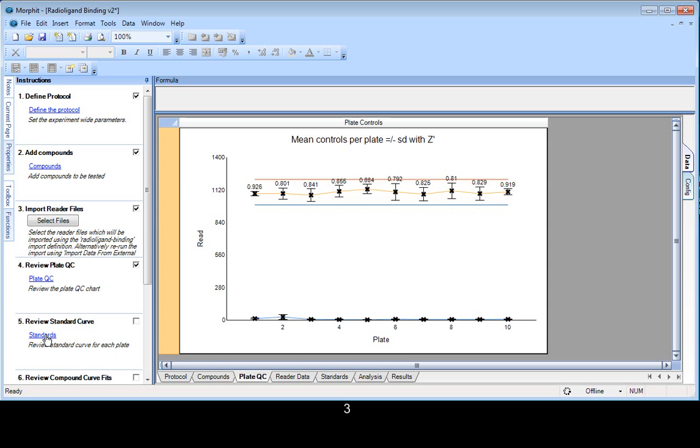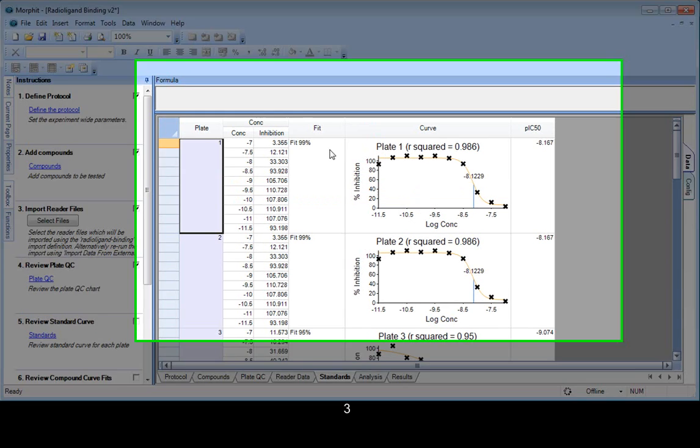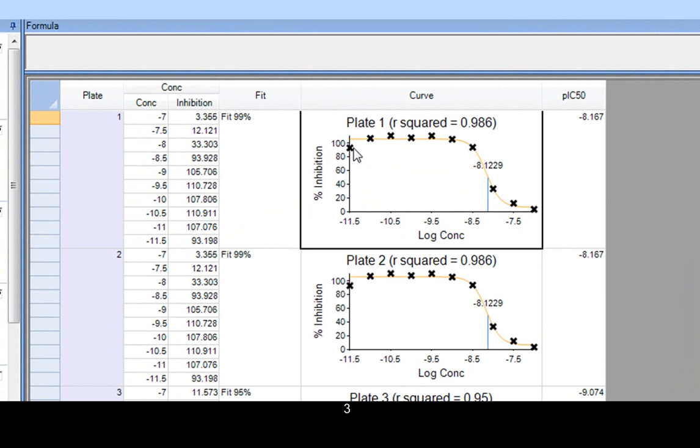So I've done the plate QC. The standard curves for each plate have been calculated. So we can look at these. And we can see in here that the concentration range is running from minus 7 to minus 11.5 log. And there's the curve. And we can interact with this curve. Knocked out data points and so on.